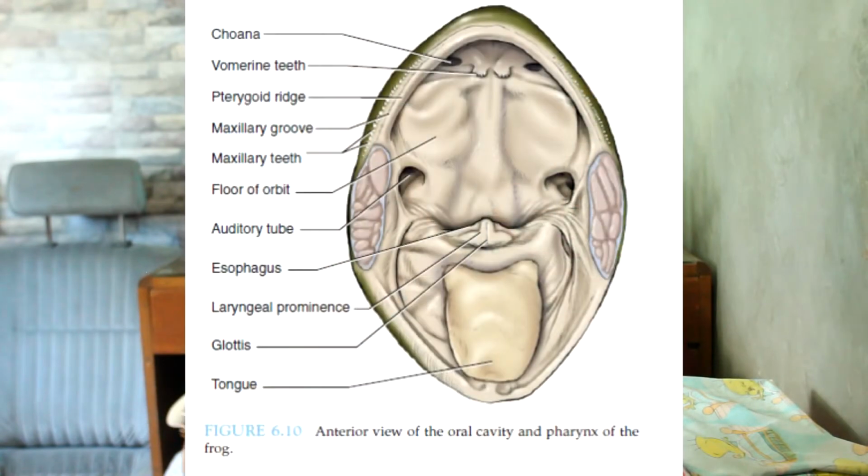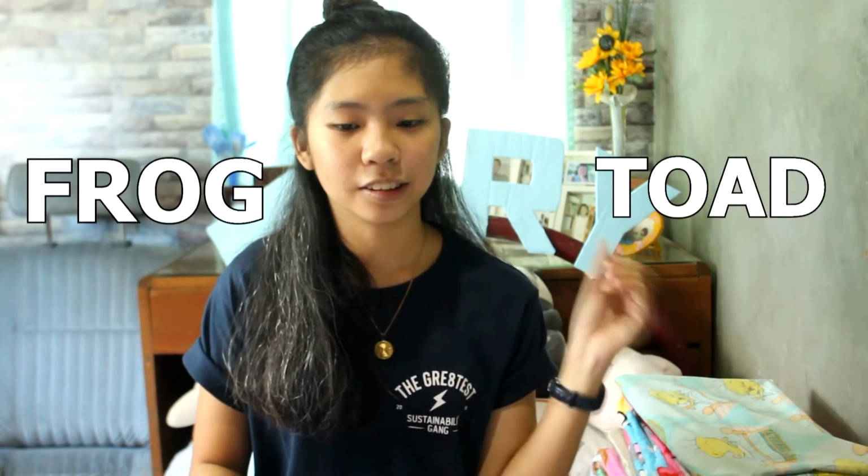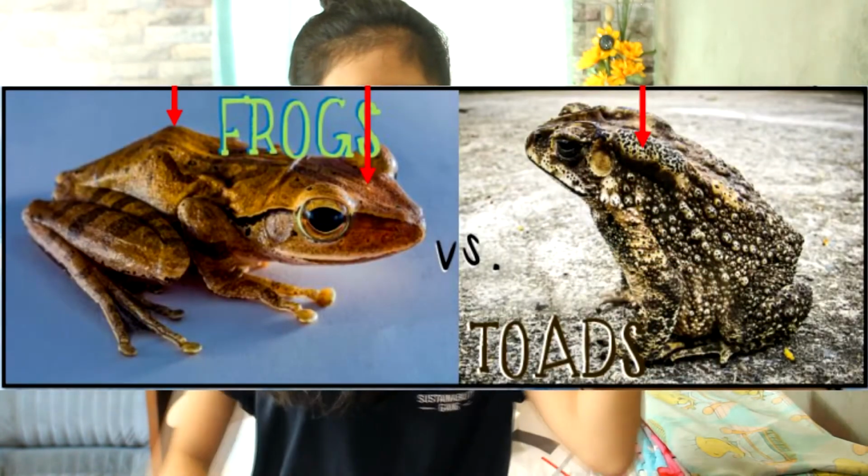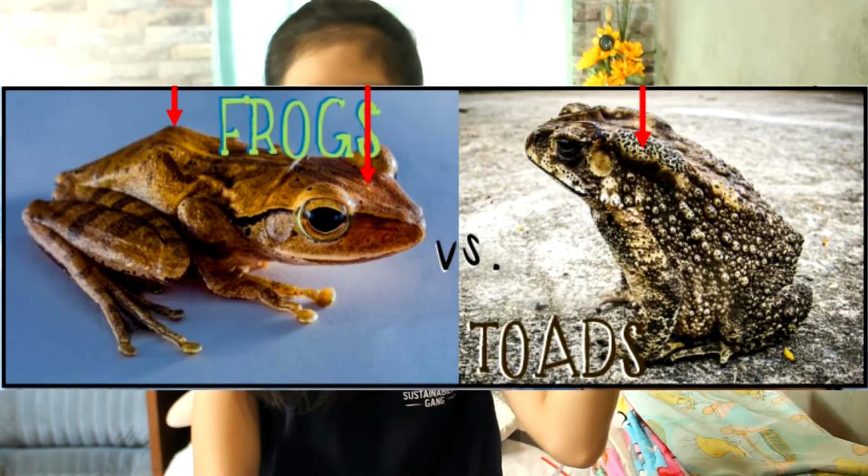Ang teeth, naay teeth ang frog. So, naa sa vomerine teeth on the upper jaw sa frog. Ang toad kay wala siya teeth. Ang habitat kay wala siya na-observe but like based on the skin and whatsoever kay mostly in water ang frog. Ang toad kay mostly on land since dry man siya kanito smooth and slick. So, the frog has a brow spot and a sacral hump, while the toad has a poison or what we call parotid gland. So, mao na siya ang ilang difference.